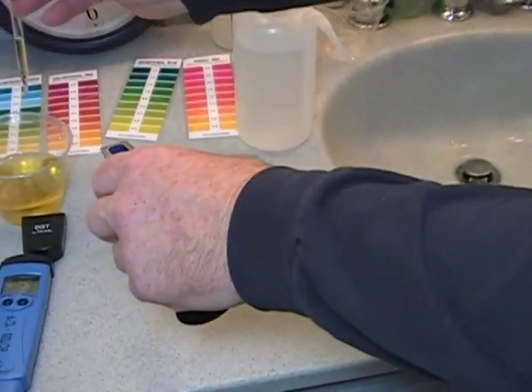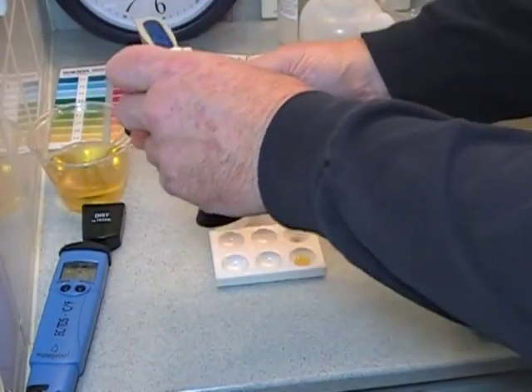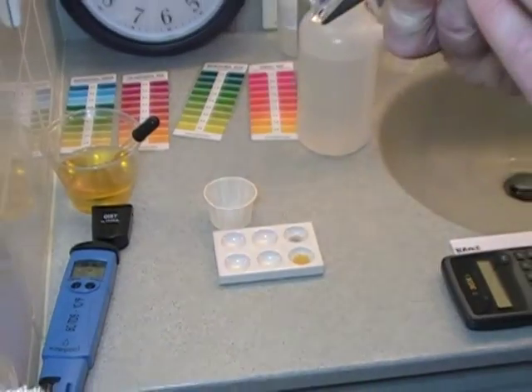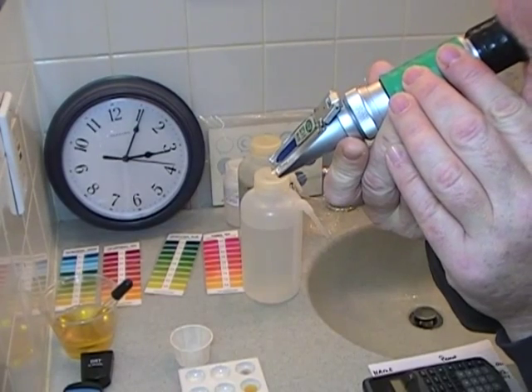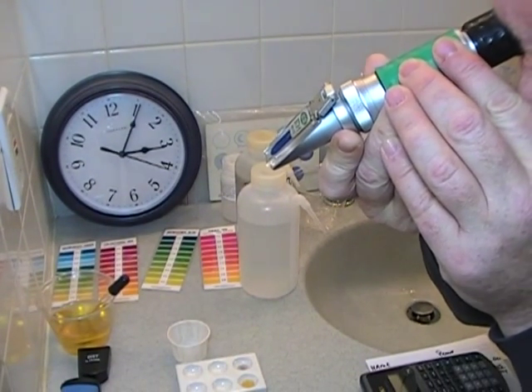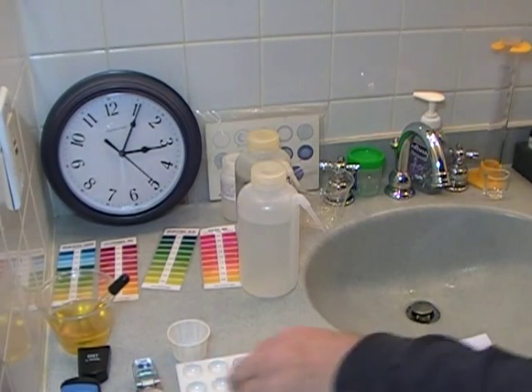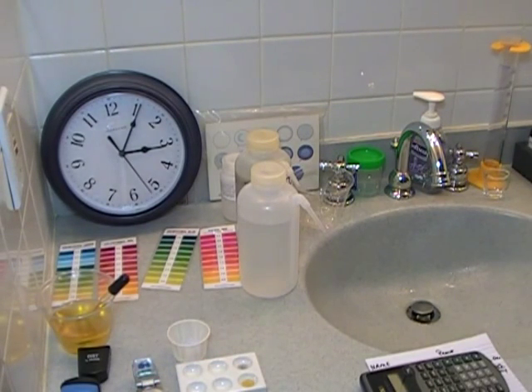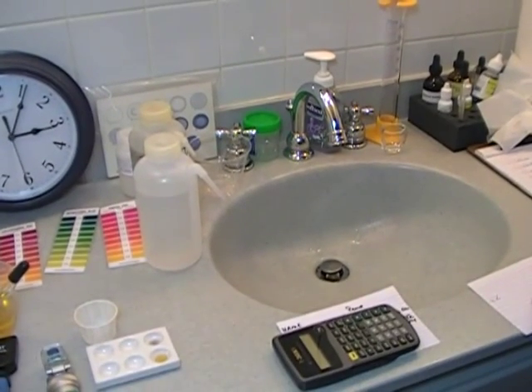Testing the sugars. One or two drops on the refractometer. Looking at it, it is a 4.8. You would write that number down — I will show you that after on the cards.